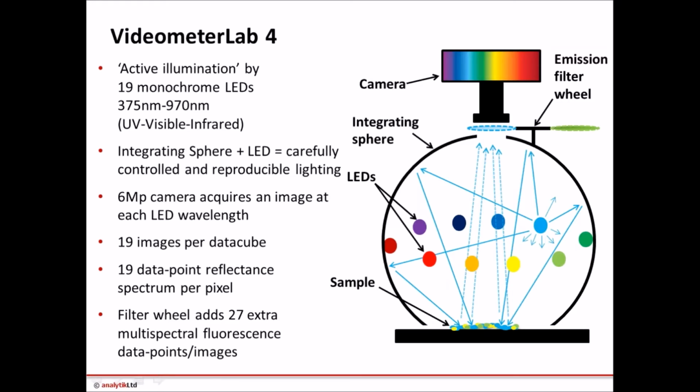A quick note: a lot of people think, well, 6 megapixels, that's not that great, is it? Because my iPhone has a 15 megapixel camera. It does, but it's not really comparing light like for like. For example, with a 15 megapixel iPhone camera, you've actually got 5 megapixels each for red, green and blue. So they're separated. The actual sensor has a filter printed on top of it to collect red, green and blue light separately and create an image that looks pretty to us.